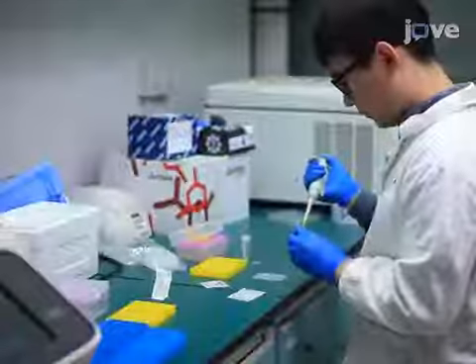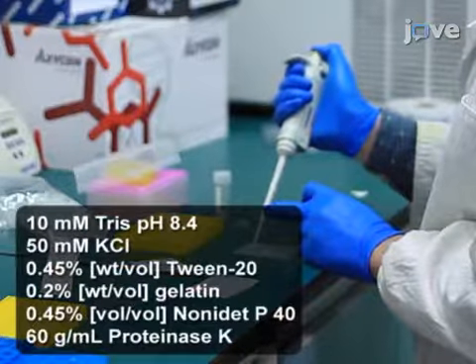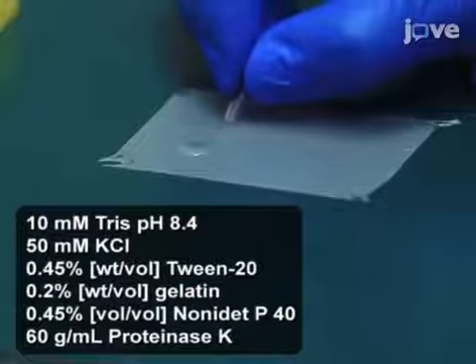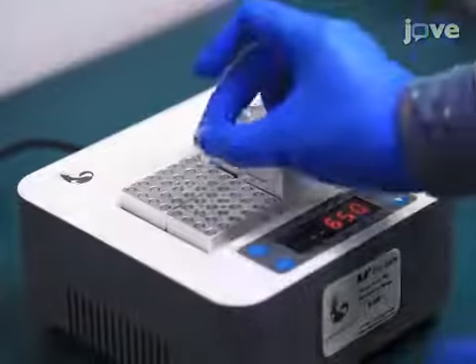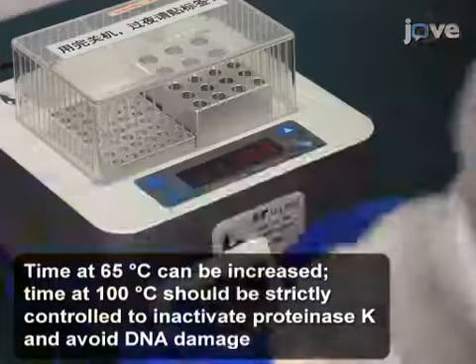To begin, collect an individual adult whitefly and homogenize it in 30 microliters of lysis buffer. Incubate the homogenate at 65 degrees Celsius for 1 hour, then 100 degrees Celsius for 10 minutes.